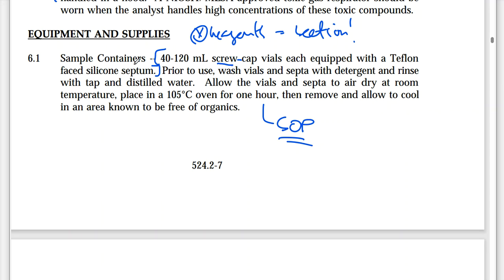So for this particular lab worker, I might say, okay, you are not going to be dedicated to sample processing; you are going to be dedicated to cleaning and preparing all of our glassware that we're going to need for this particular method. That's what your role is going to be today. And I would give them an SOP. The SOP would include the cleaning parts of everything that needs to be used: sterilization, cleaning, washing, drying, you name it, this is where it's going to be found. And that's how those SOPs are built.